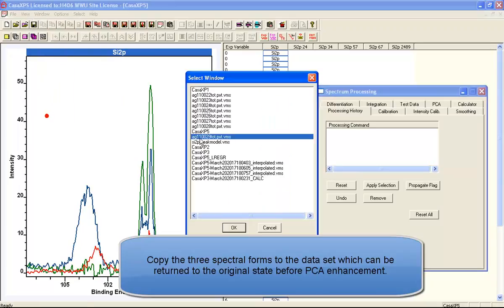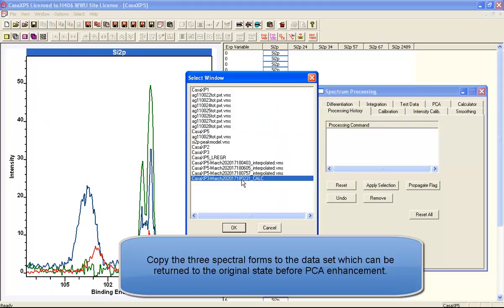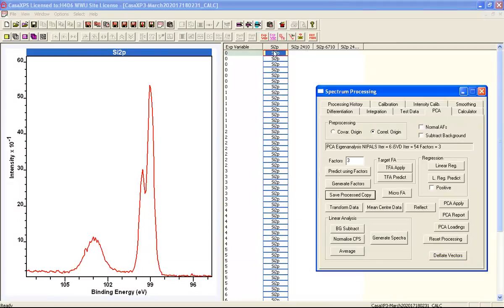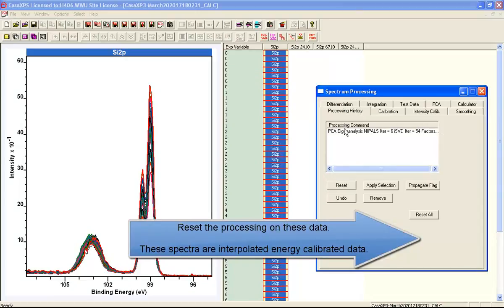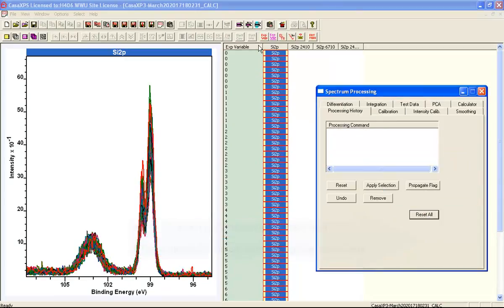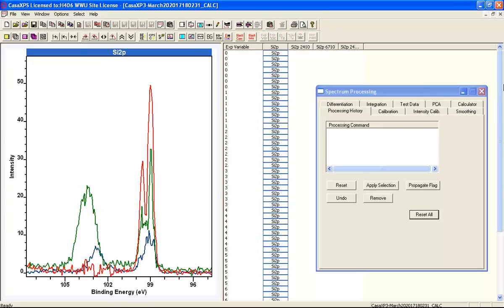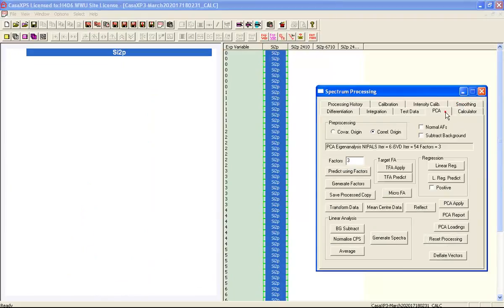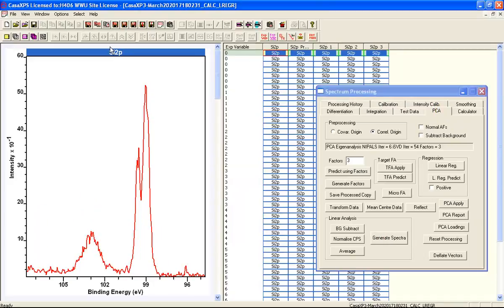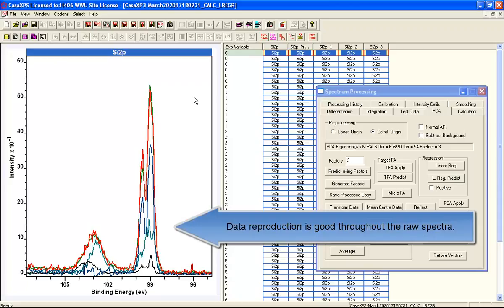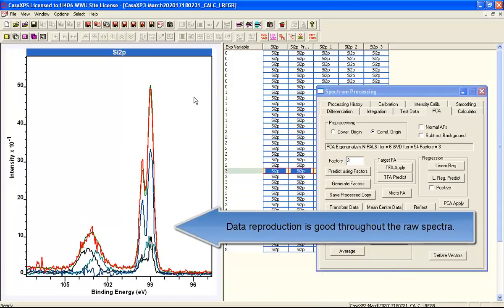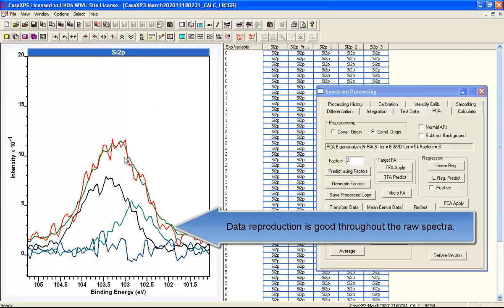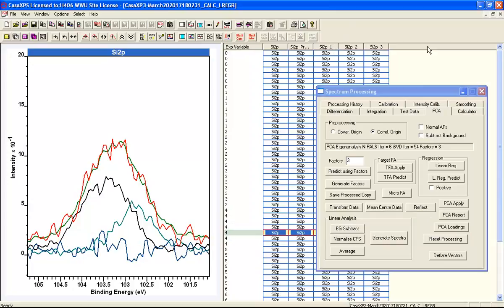The real acid test is to go back to the spectra with full dimensionality — that is, with noise in the data — and perform the same calculation. We'll keep the energy calibration but reset the principal component analysis noise reduction, then perform the same calculation overlaying the three different components and performing a linear least squares decomposition. Looking through the data to see how well these reproduce the full-dimensional data set, they're doing a reasonable job.